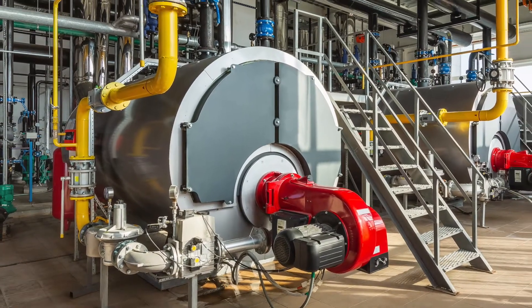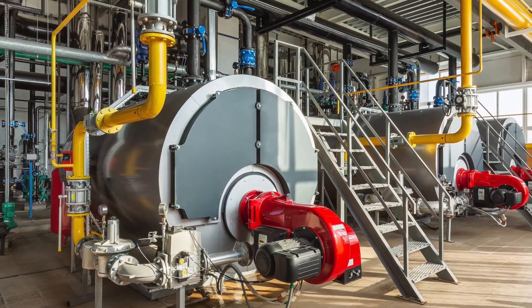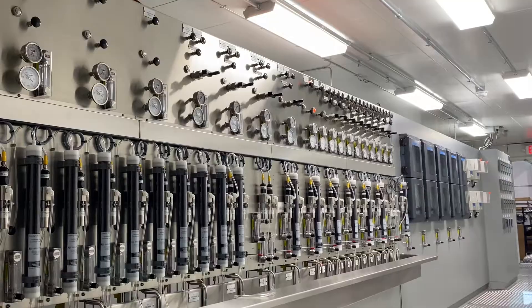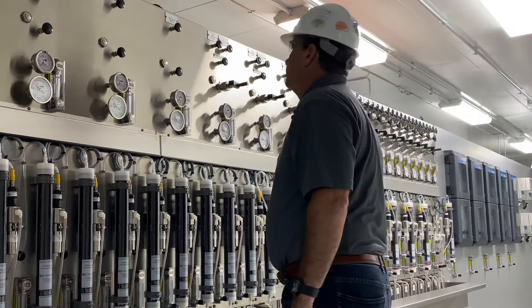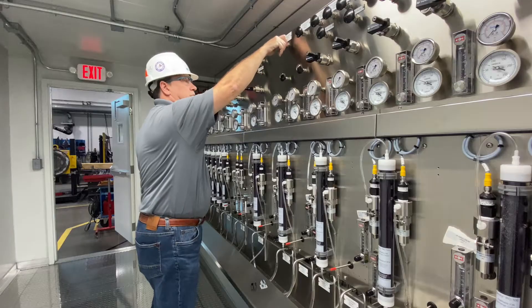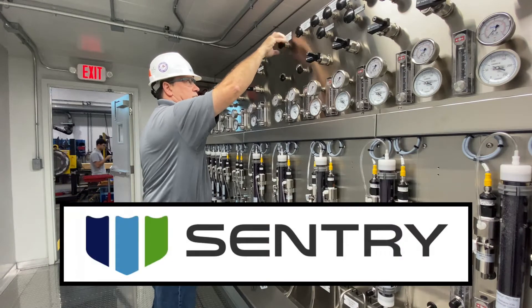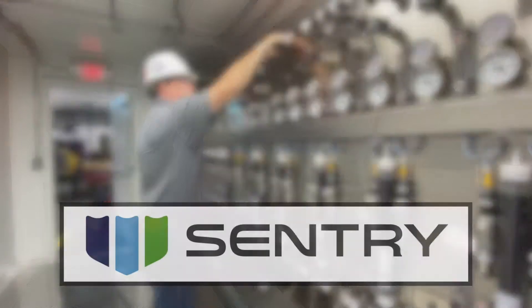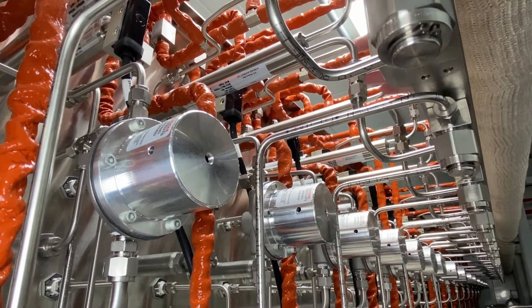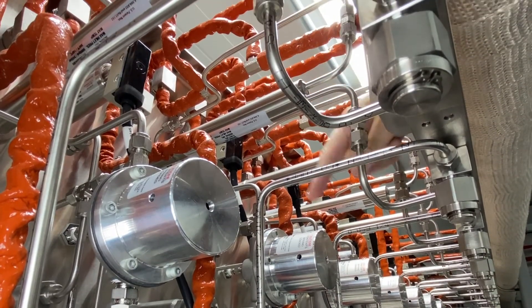Effectively monitoring cycle chemistry in power plants relies on the availability, accuracy, and trustworthiness of analyzer data, the quality of which is governed by a steam and water analysis system panel like this one manufactured by Sentry Equipment. This system safely transports a representative amount of the process stream without changing the parameters of interest.